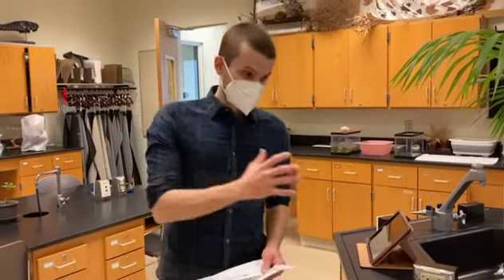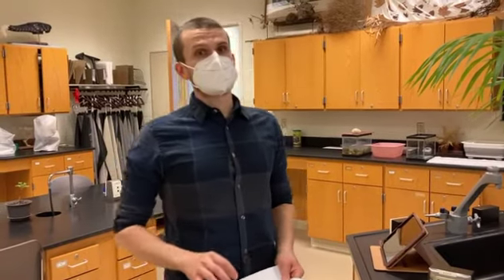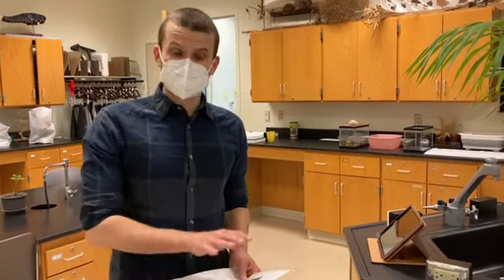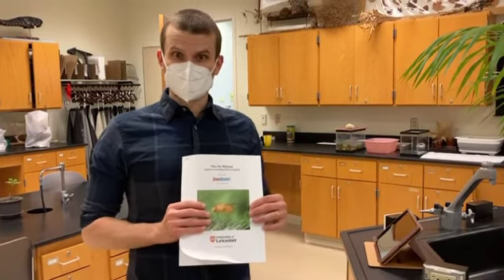breed. And then after we're done with our fruit fly breeding and Punnett squares, we're going to go over and take a look at our chi-square distributions with random samples. The last thing we're going to do is tie that chi-square to our fruit fly genetics. So let's go ahead for now and sit at the computer and take a look at our fly manual.